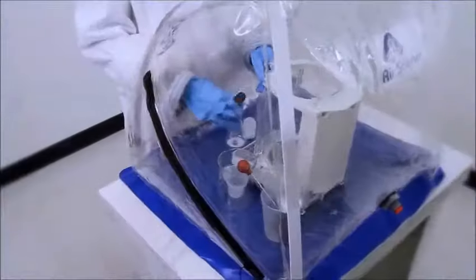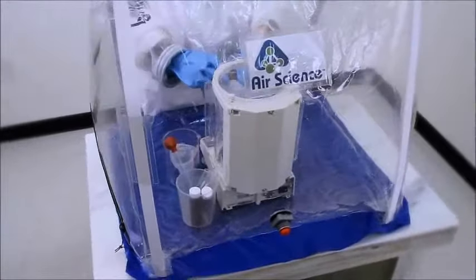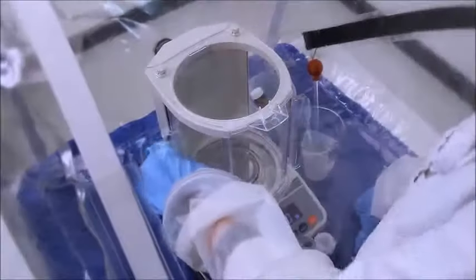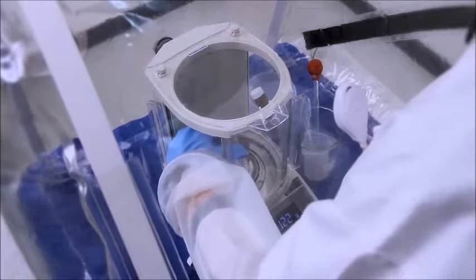If this situation looks familiar, you know that space can be an issue in the lab. The HRA is especially effective in the tight confines of fume hoods and glove boxes. With its rotary doors, the HRA needs no extra space to open the doors.